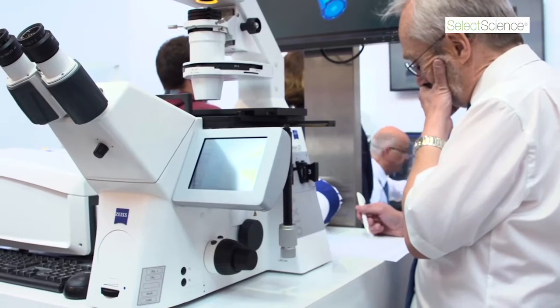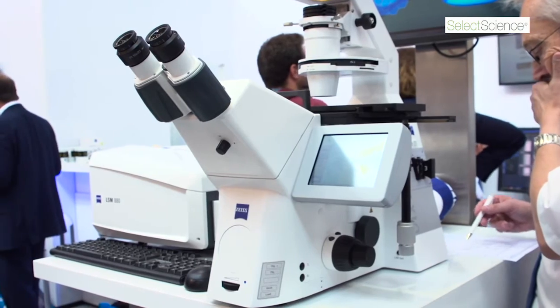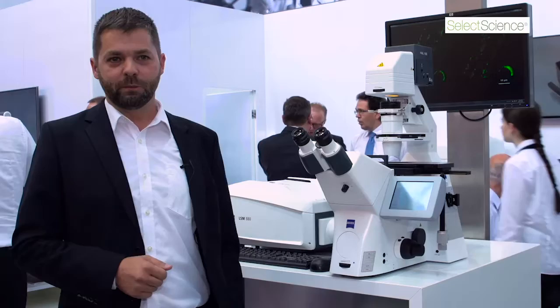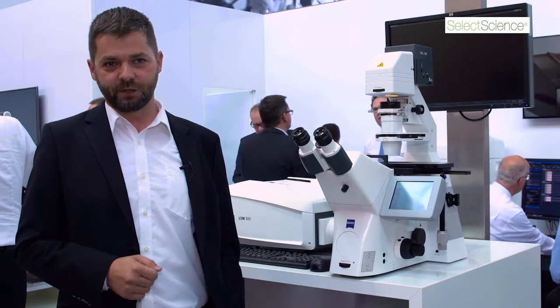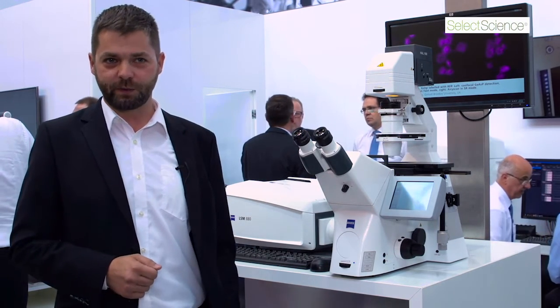The LSM 880 with AirScan is a very flexible confocal microscope that allows all applications that were possible before with a confocal microscope, but now it also brings high resolution and very fast imaging. On top of it, we see the LSM 880 with AirScan as an innovation platform.